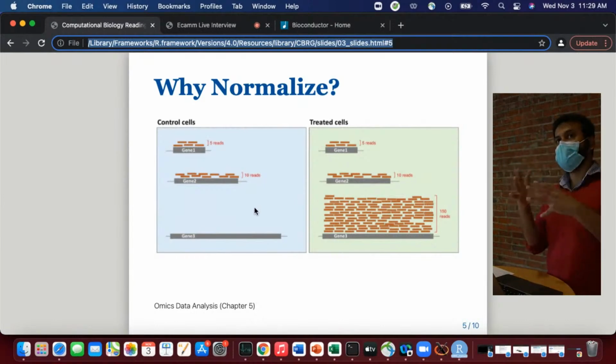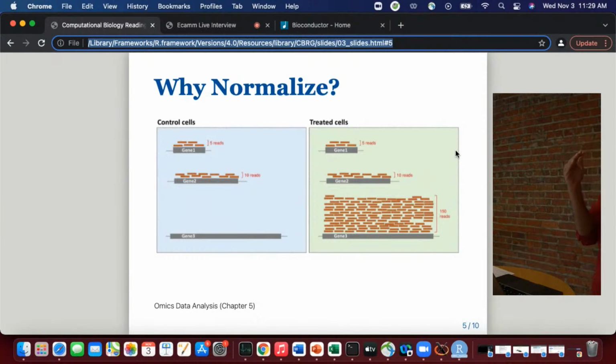And so if you just take into account total read amount and normalize to that, it will artificially look like gene 1 and gene 2 are getting suppressed. Their expression's getting suppressed. All of these are normalization. So DE-Seq 2 does a few different steps; the normalization process involves a few different steps. And the paper explains what these steps are really well. But rather than get into the technical details, it performs this normalization for you.